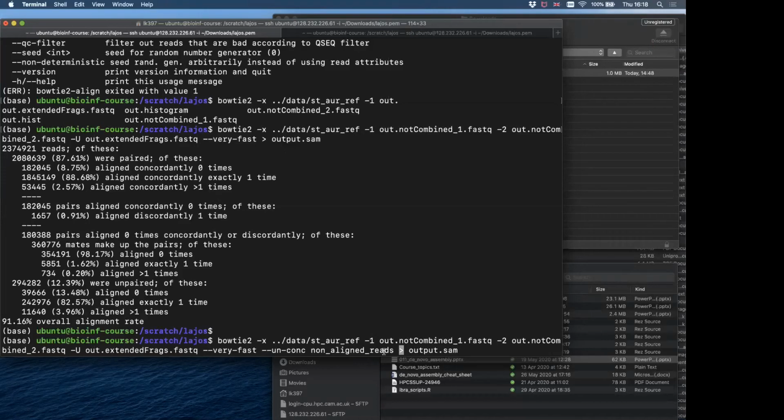And then I have another question, because I'm assuming this is a very high percentage, basically because we're looking at one particular genome, right? But if you're looking at metagenomes, that percentage should decrease, or do you still use Bowtie, or is there another tool?